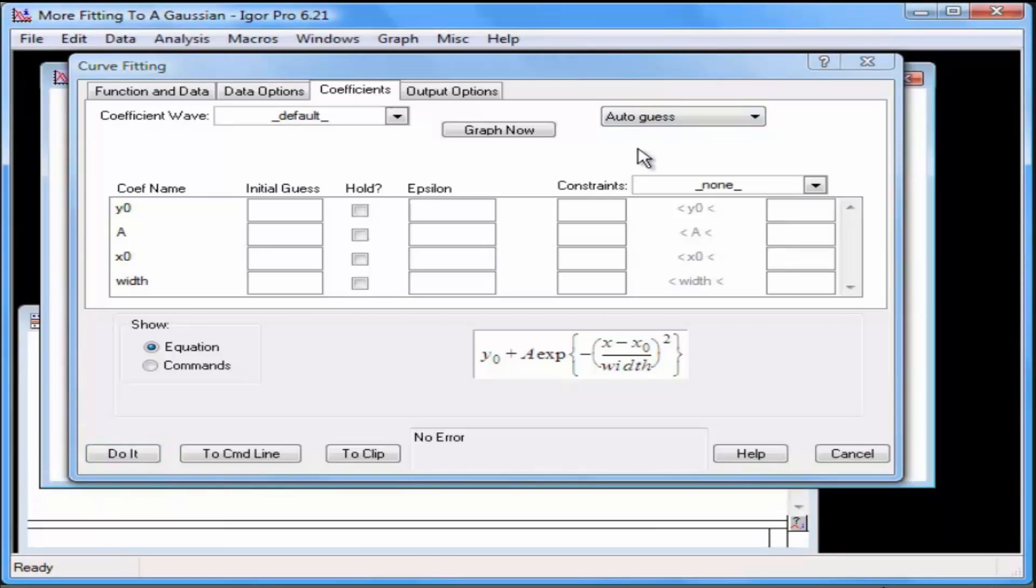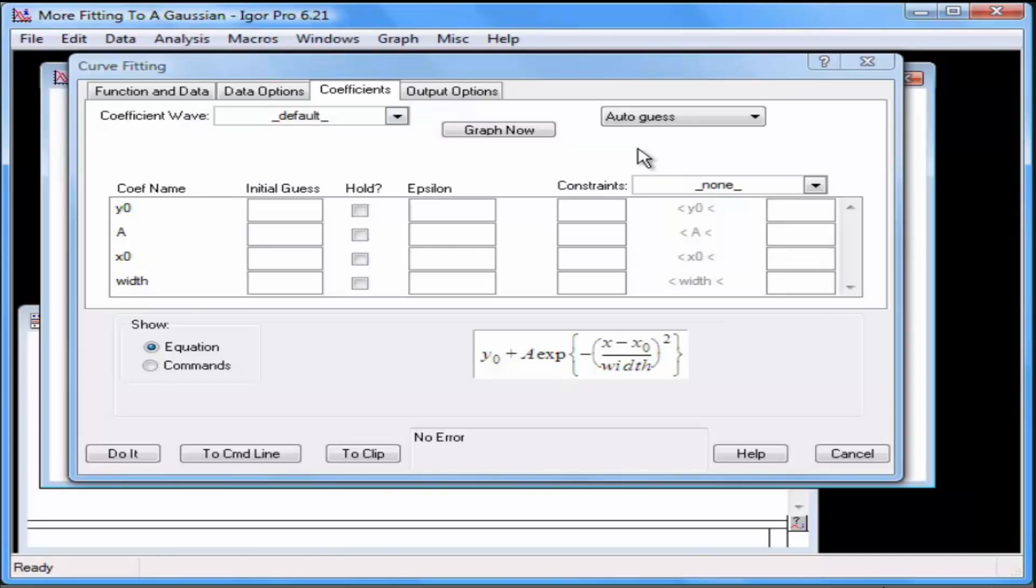When you know that your data conforms to one of Igor's standard models, the Auto Guess option will usually provide good initial guesses for the model's parameters. If you have a good estimate of what the parameters should be, you can select Manual Guess from the pop-up menu and then enter the initial estimates next to each coefficient.